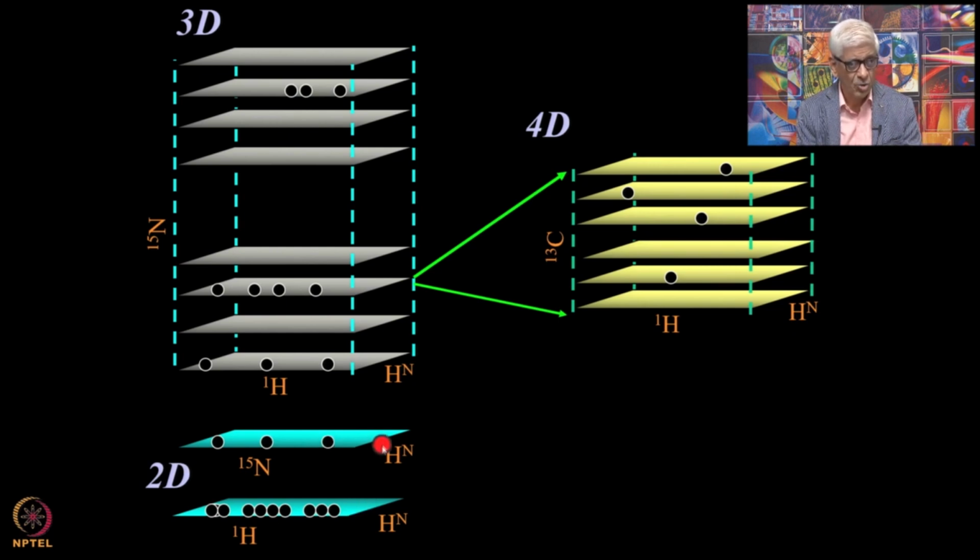Now if you look at the proton N15 correlation spectrum, you are seeing 3 N15s. Therefore there are certainly 3, because there are only 3 peaks there. Now instead of making just a 2-dimensional spectrum, HSQC TOCSY or something like that, instead of spreading them along the proton axis, extending the proton axis here, we actually pull this spectrum along this axis.